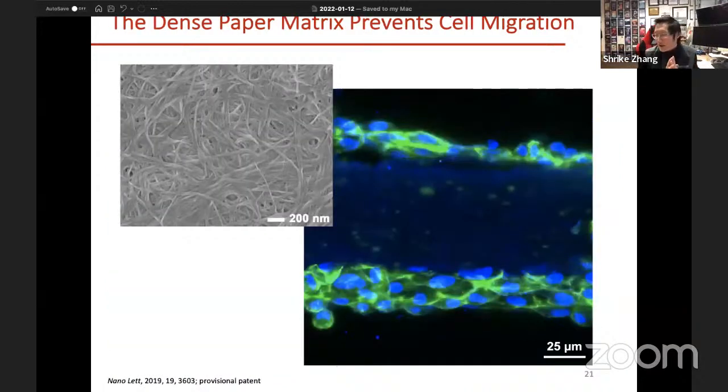All right, so this is the first version of the paper-based devices that are sacrificially printed. We identified one of the issues: these are based off very densely entangled nanofibrils of the bacterial cellulose. So if you look at cross-sectional views, even though you can have the breast cancer cells seeded onto the devices, they are pretty much on the surfaces of these devices, because again, you have very dense matrix here. The cells cannot really migrate into the interior area of the devices, meaning that you're making a pseudo 3-dimensional device, but it's not a truly 3-dimensional device for cellular interactions, right?